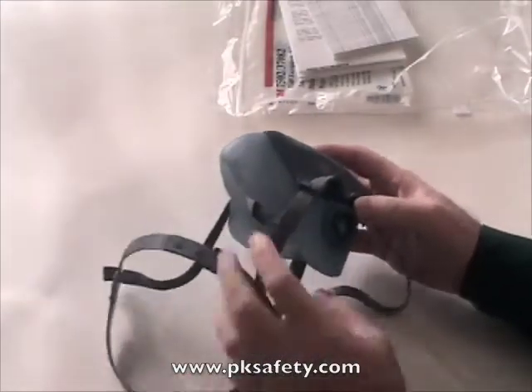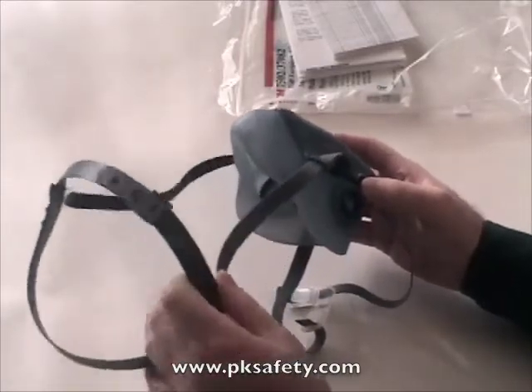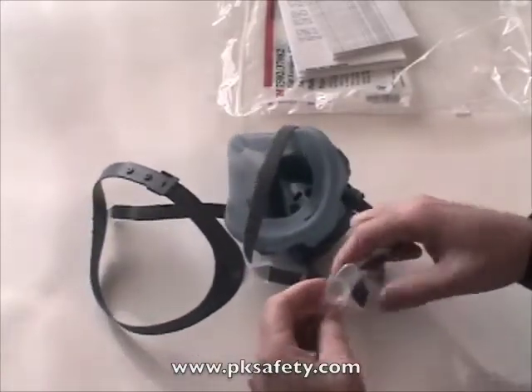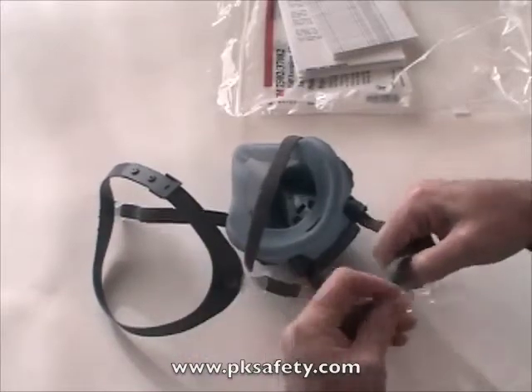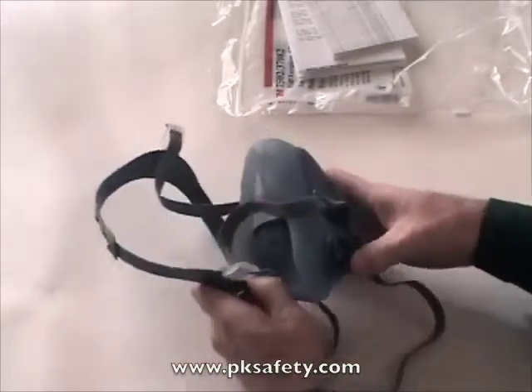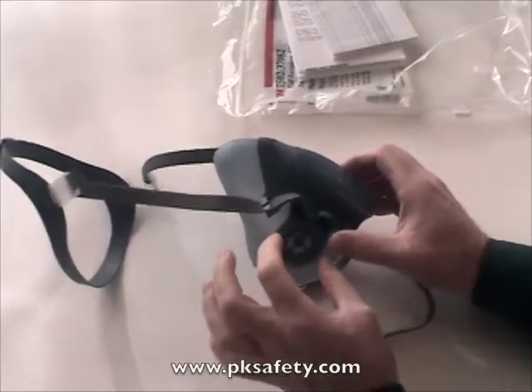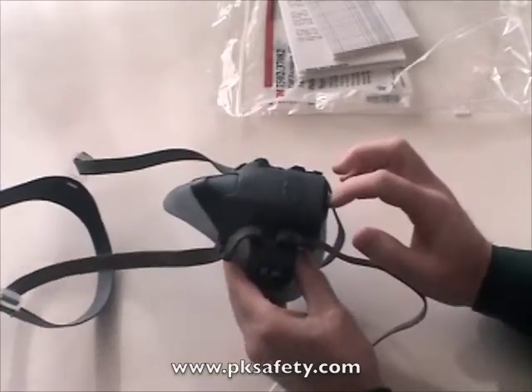The straps are a fabric-covered elastic. This part goes on the top of your head, and then there are straps that go around the back. They have a quick disconnect connector to allow you to snap them on easily. There is also a mask connector on the front where your cartridges are going to go, and the exhalation valve.